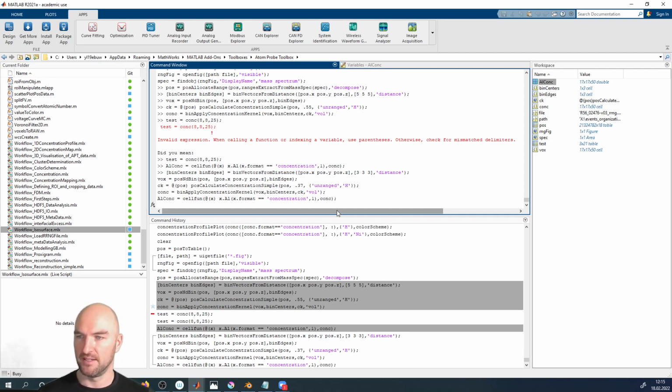And this is why we want to keep everything that flexible, because maybe for your application it's relatively easy to write something like that. If you work on superalloys, you might have an overlap between chromium and iron, and an overlap between nickel and iron. And you're just going to be able to say, okay, chop up anything that's in this range, and allocate this percentage to iron, this percentage to nickel, and stuff like that.